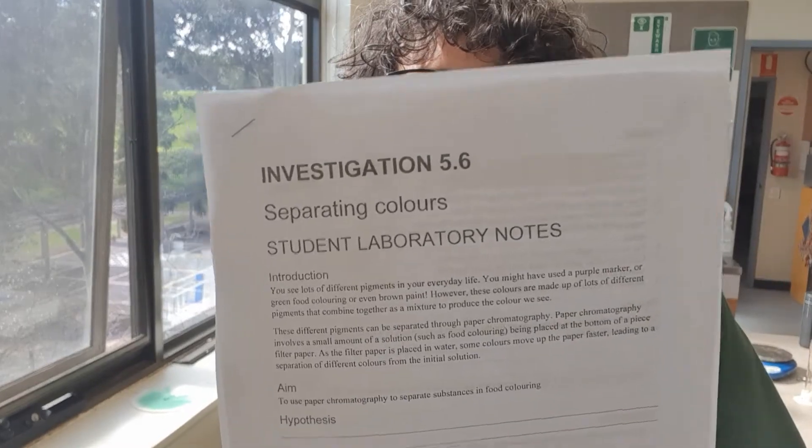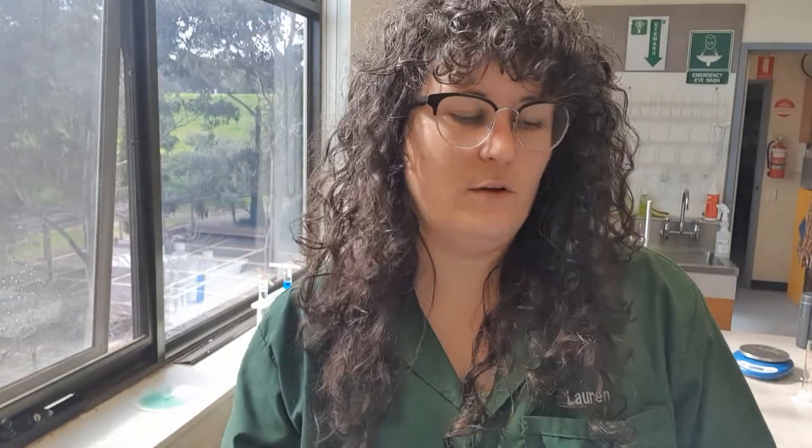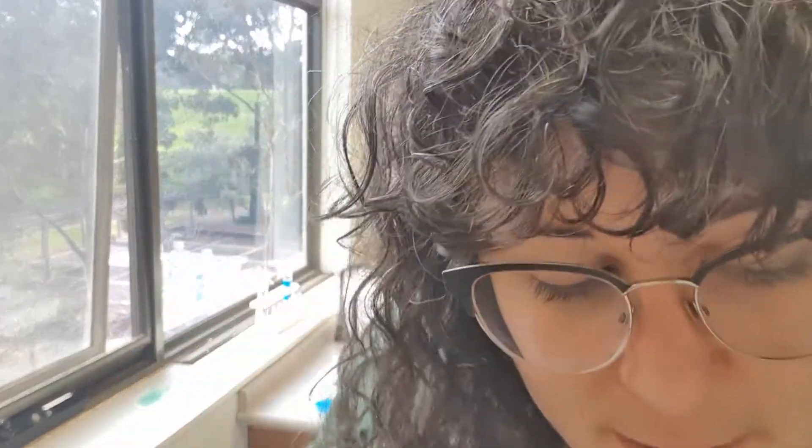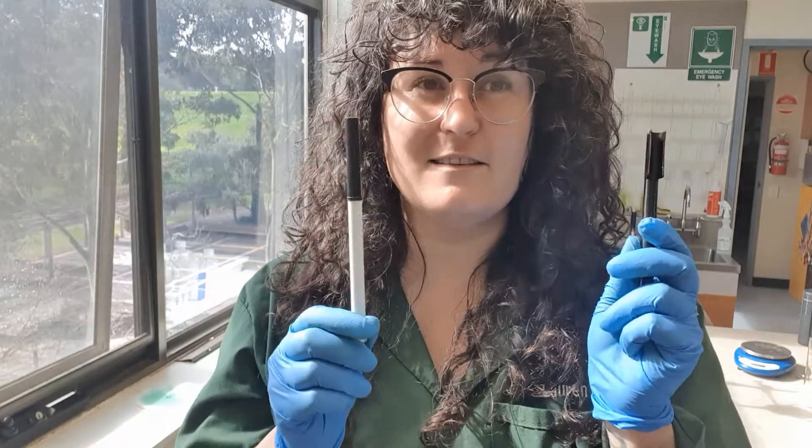You should have the prac sheet with you. We're going to separate some colors out of food dye — and the prac sheet doesn't say this, but I'm adding it because it's really cool — we're also going to separate the colors out of some black textas.